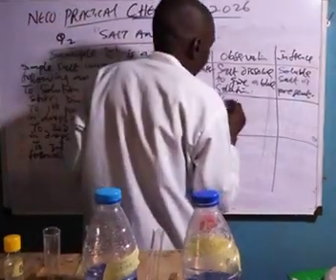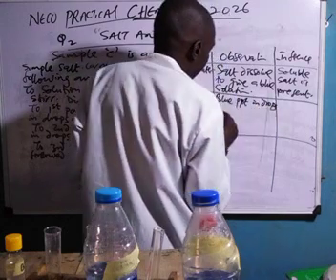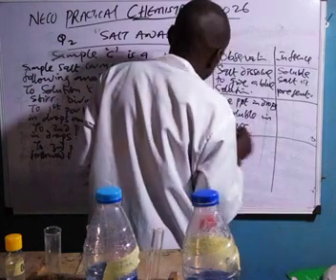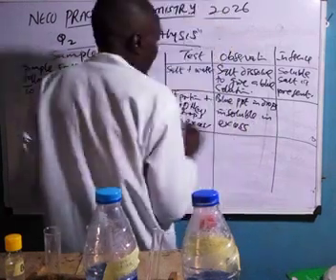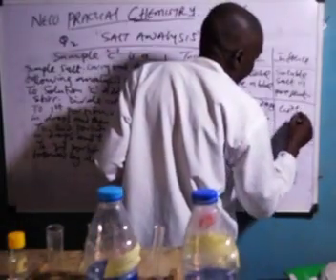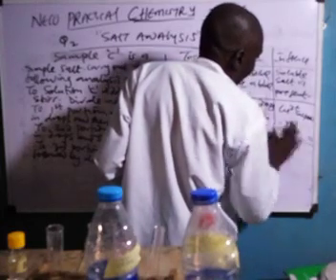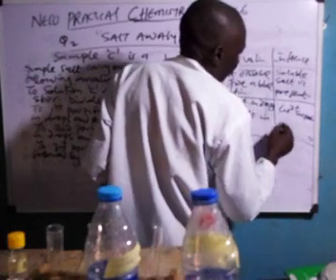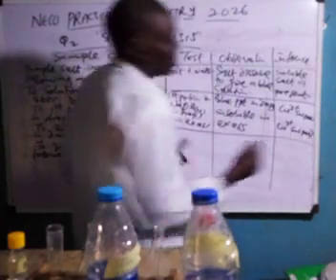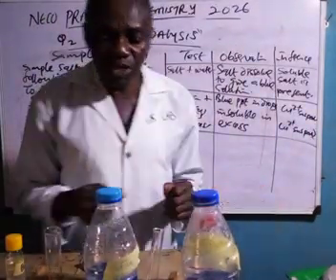Observation: blue precipitate in drops, insoluble in excess. So what you suspect is copper. Suspected Cu2+ copper. Just put copper suspected. Okay, Cu2+ suspected. To write it once is okay, but sometimes write it twice, when they are looking for where to put marks to your own advantage.